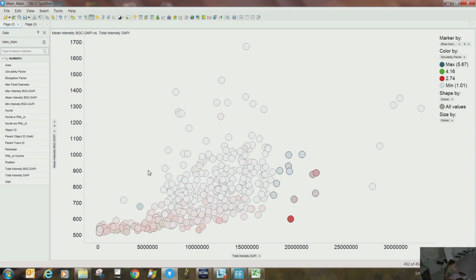By default, if you want to mark it, you can do it using the square, this one, just draw a rectangle over the region that you are interested in. But if you are not satisfied with this rectangular selection, then just press the Alt key and you can draw a free region. These guys will be selected when you press the Alt key. This one is selected.